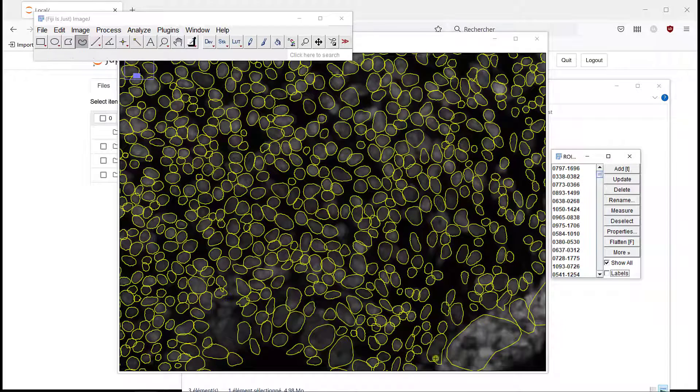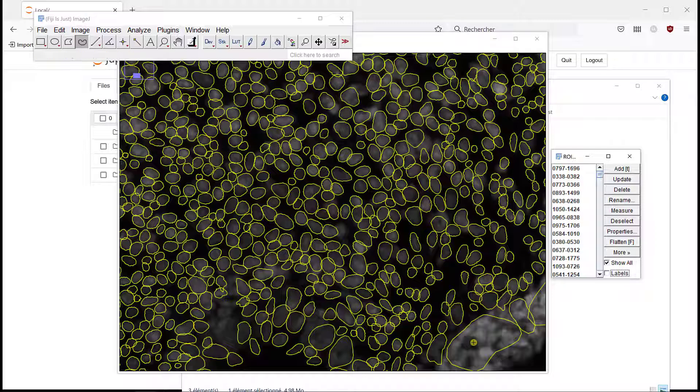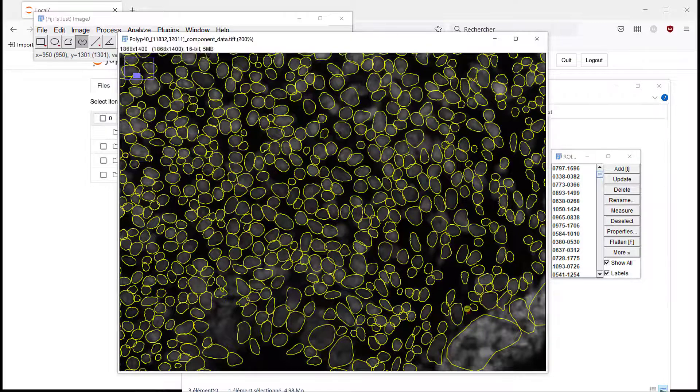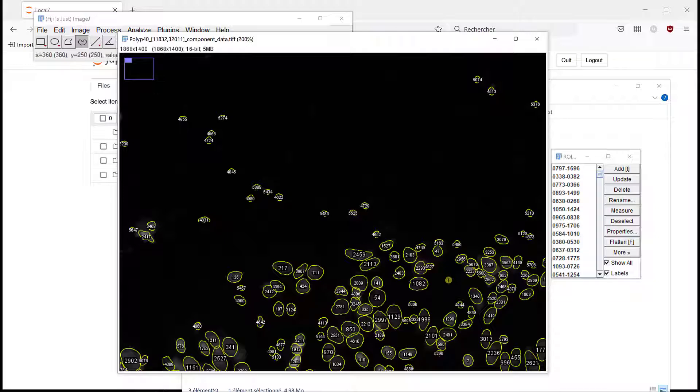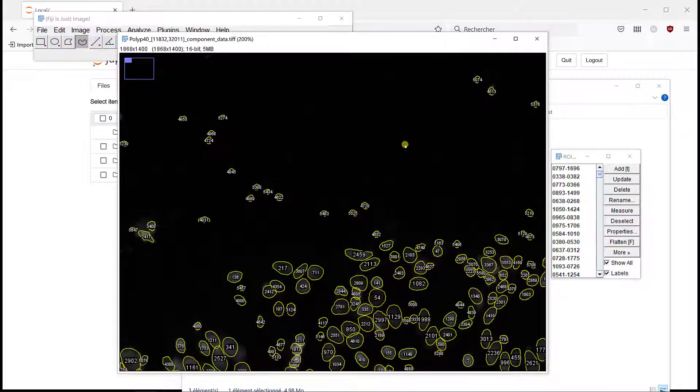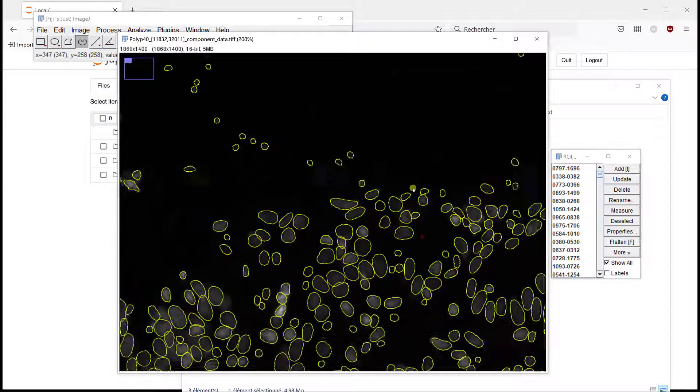And when we have this kind of, you know, it's not... sorry, I want to... it's because I'm not in the image.